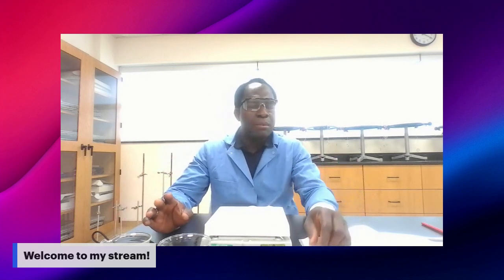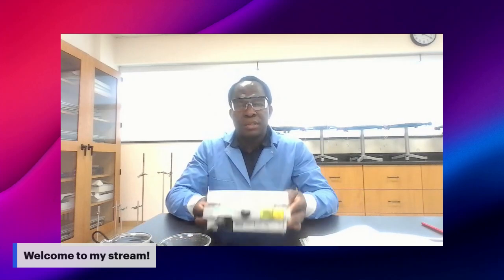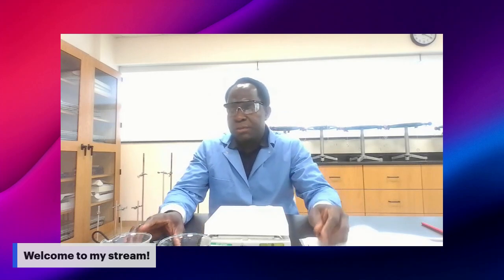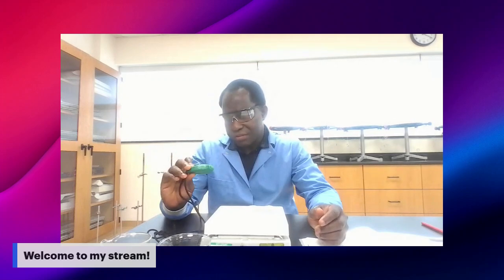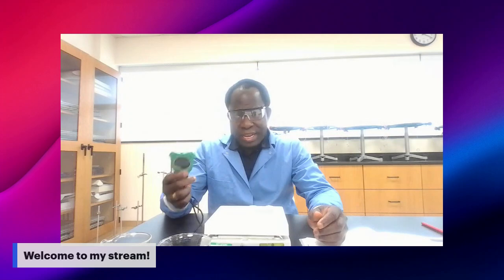So to do this lab, you need, let me show you, a hot plate. Okay, you need a digital thermometer. You also need a timer. For the timer, you can also use your cell phone. Okay, you can use your cell phone to time, or you can also use a real timer.